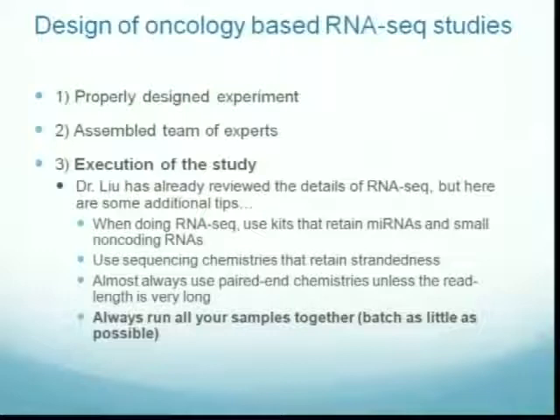Use sequencing chemistries that retain strandedness. The SOLiD platform has always retained its strandedness. Illumina originally didn't. I think now almost everyone is using a directional Illumina protocol. So most people are now using a stranded protocol, but if you're ever left with the choice, use a protocol that retains the strand of the genome from which your RNA is being expressed.